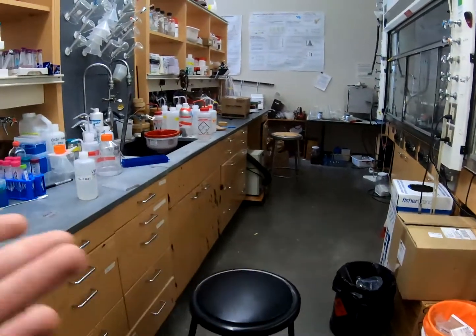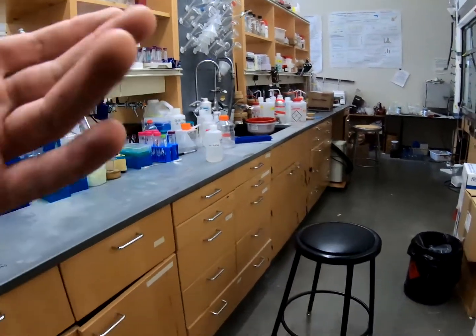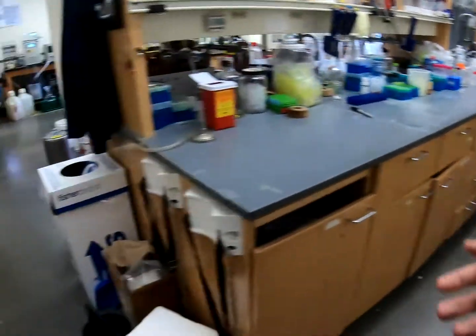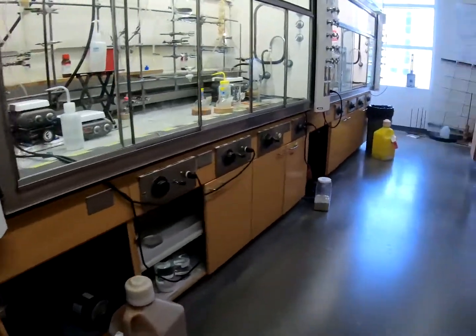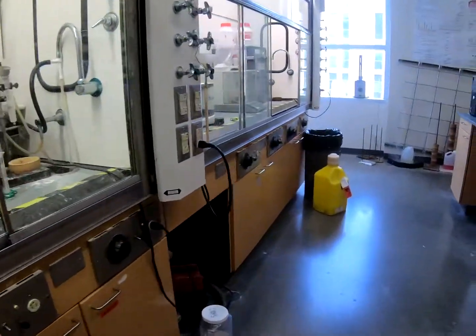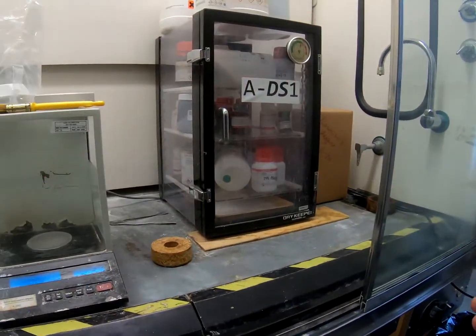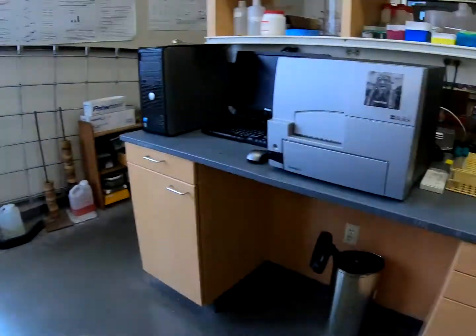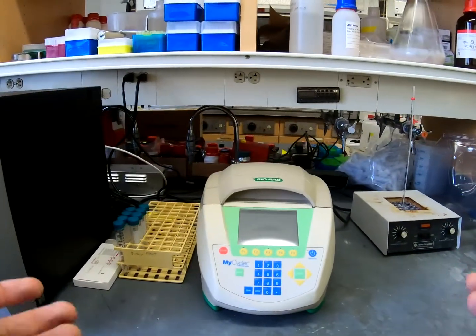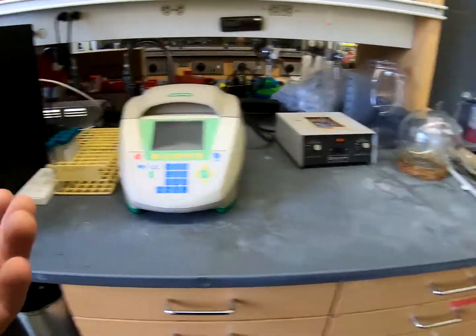And pretty much this follows the same general structure for all of our benches and hoods and all of our modules. So coming over here we've got another bench. This one we use for storage, or a dry cabinet to keep our compounds that we need to keep away from air and water, as well as our thermocycler here, which we use for PCR amplification or mutagenesis typically.